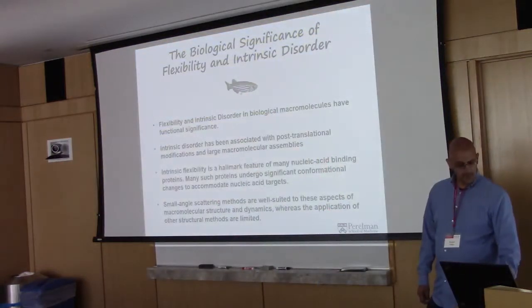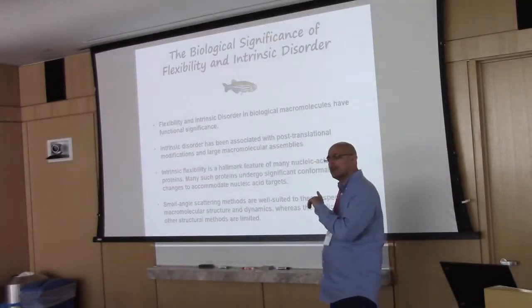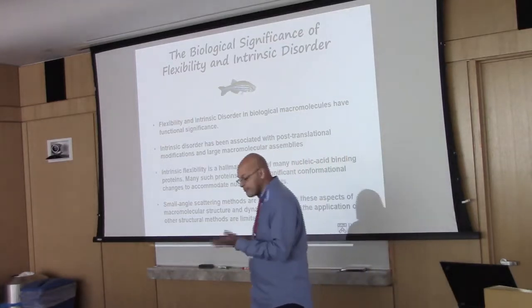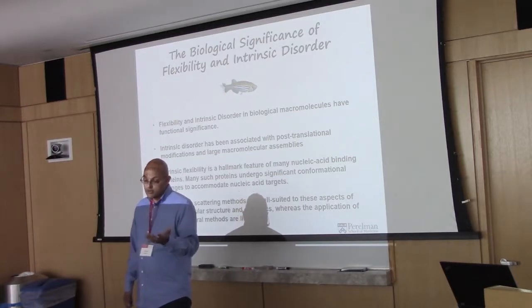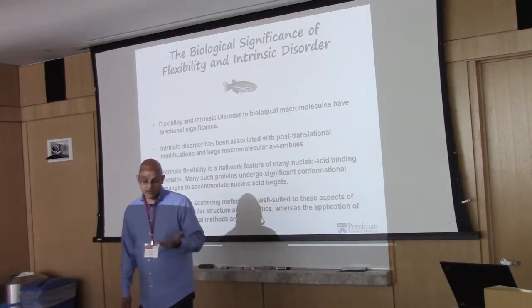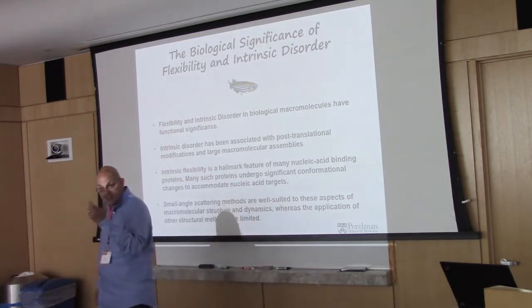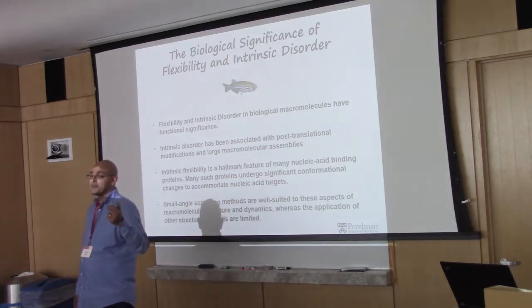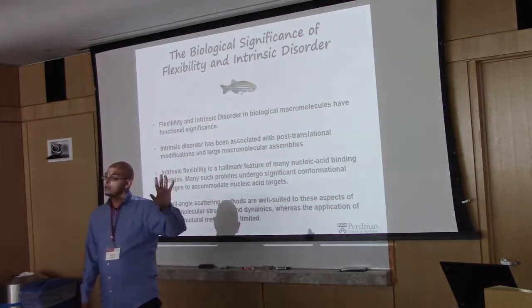So, just to quickly review the fish, because there are concepts in here that are important again here. Intrinsic flexibility and disorder are innate properties of many of the open reading frames in the eukaryotic genomes, as well as bacterial genomes. The reality that crystallographers don't like to talk about is that most of the things they crystallize and can resolve and see the electron density of aren't intrinsically disordered and floppy. Those are the things lost due to averaging. In a way, they wash away the electron density.